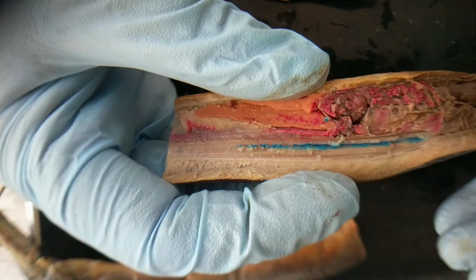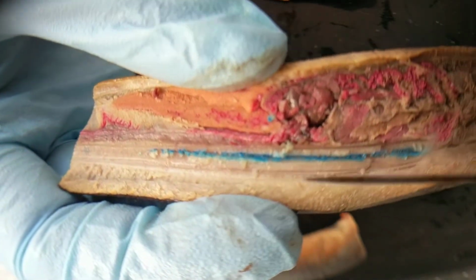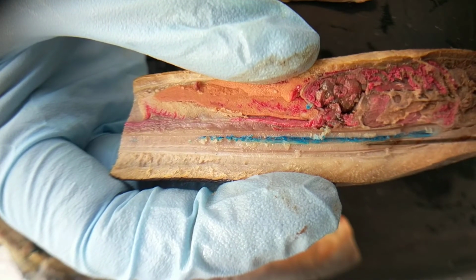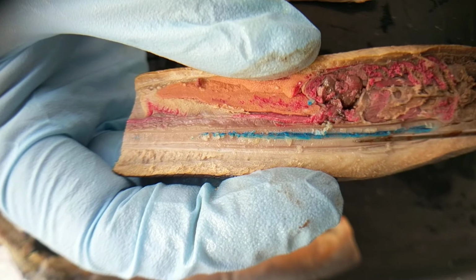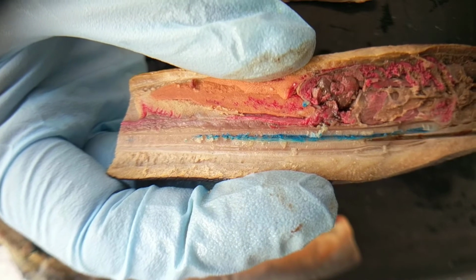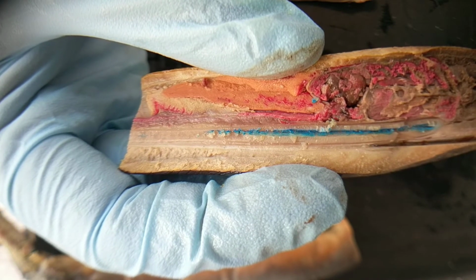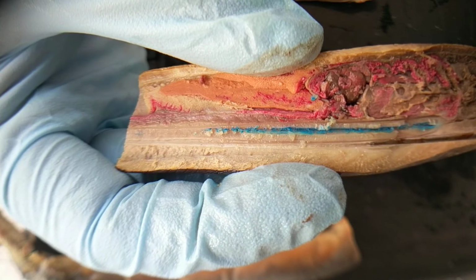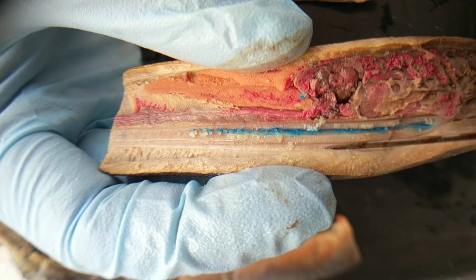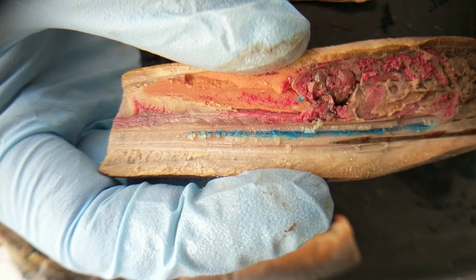There's a notochord. Here is the notochord. So let's see if I can focus that. Okay, here's the notochord. It kind of feels fibrous. It's not hard, but it's like a stiff rod that you could bend, just like you'd think. And then above it, you see right here, this is the spinal cord, the dorsal nerve cord, right? So those are two of the traits. When the nerve cord is dorsal to the notochord, that is a chordate trait.